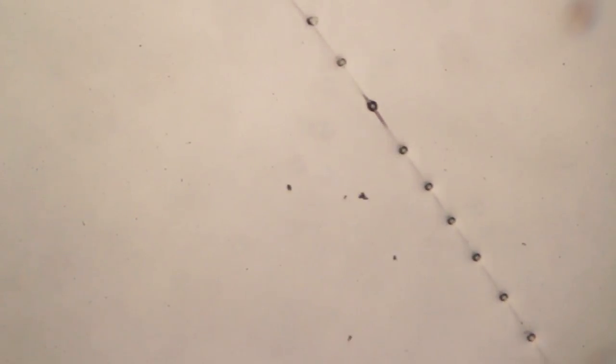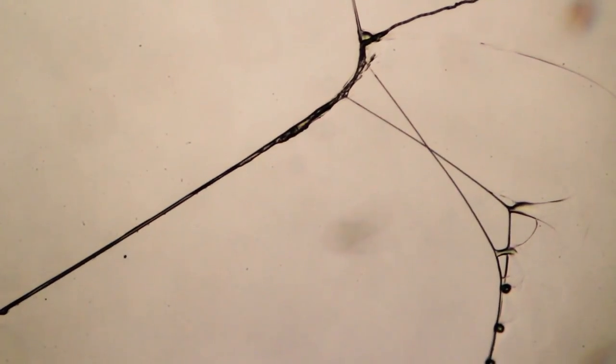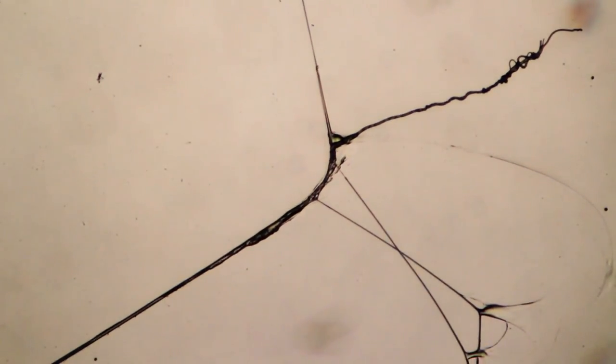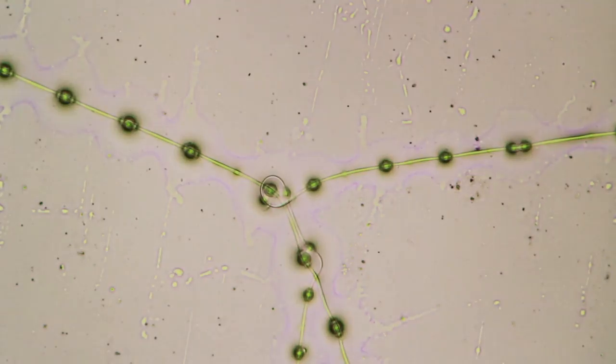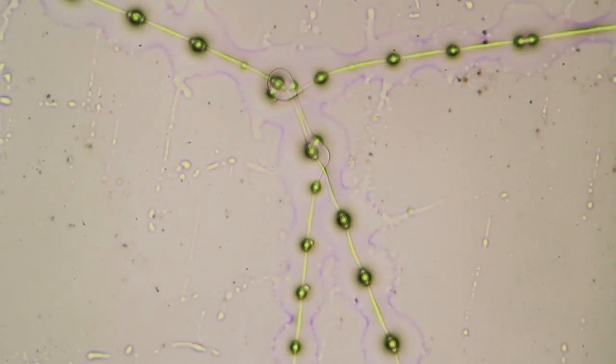You can actually see that there are different types of threads that perform different functions in the spider's web. Here, for example, you see several of them glued together, but they do not seem to be sticky because they are missing those circular glue droplets. Here again the glue droplets, a little bit larger, and you can also see that some of the glue has actually spilled onto the microscope slide.